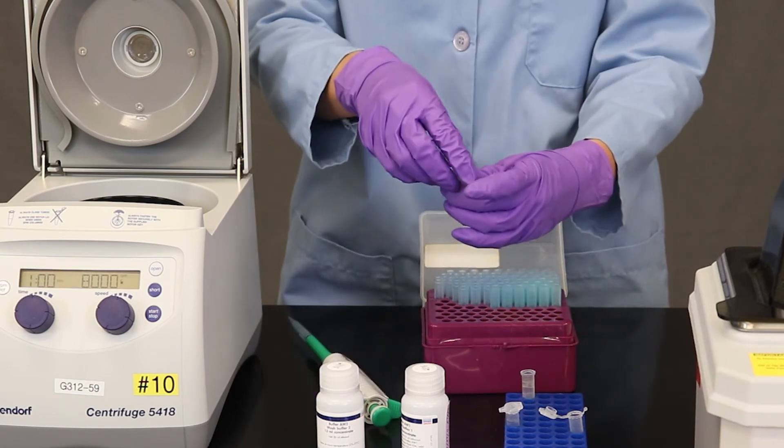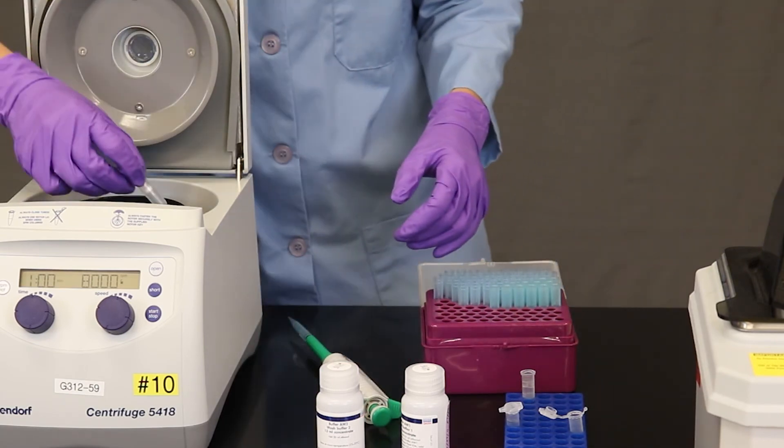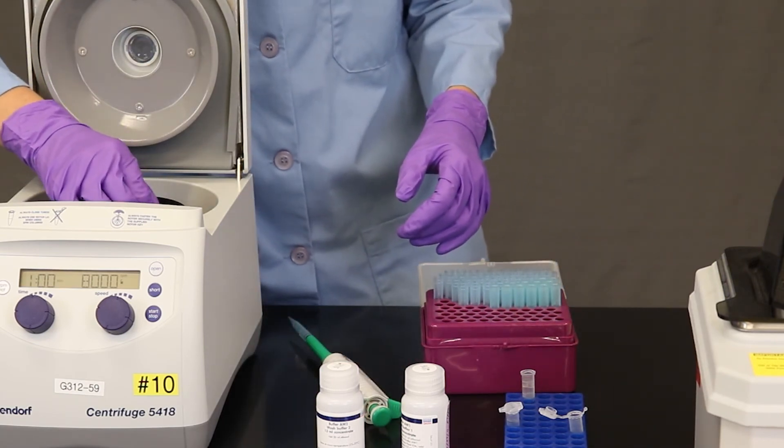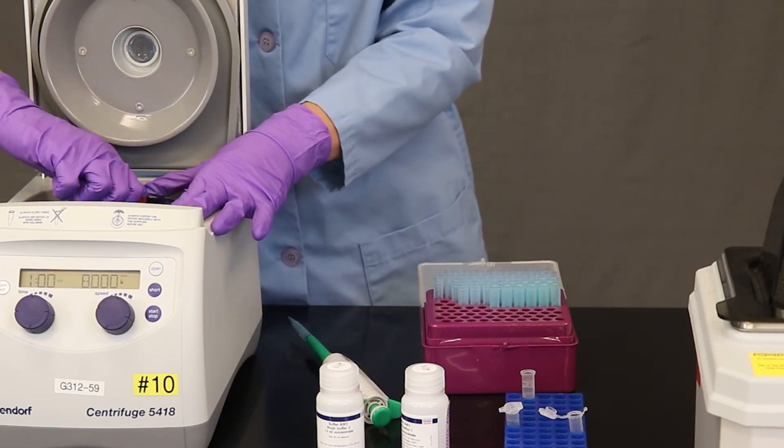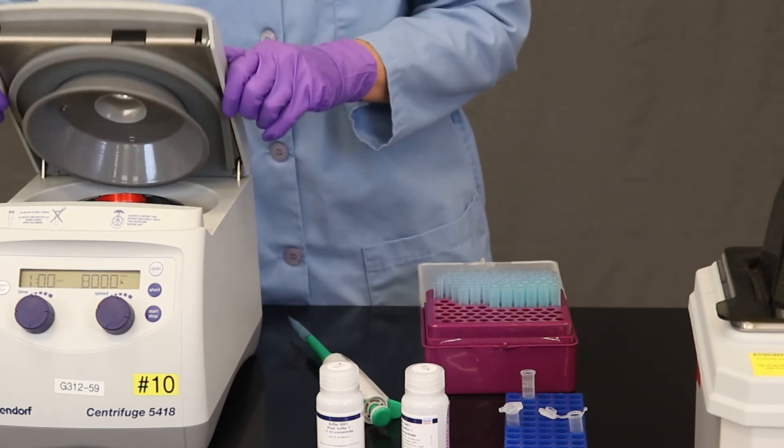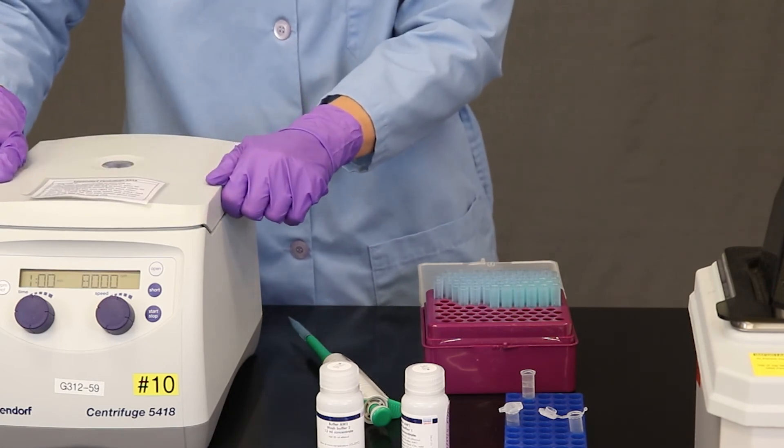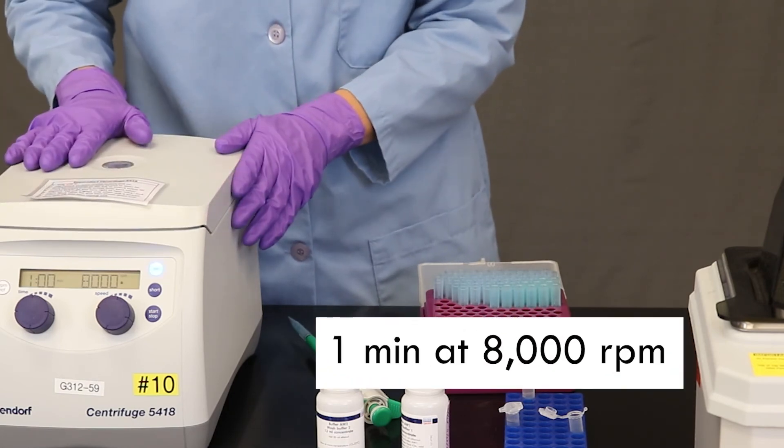So here's my wash buffer. And I'm going to go ahead and add the 500 microliters. And then I'm going to place it back in the centrifuge. And we will spin it again with the hinges pointing up and putting the top on the rotor. We will spin it for one minute at 8,000 RPM.